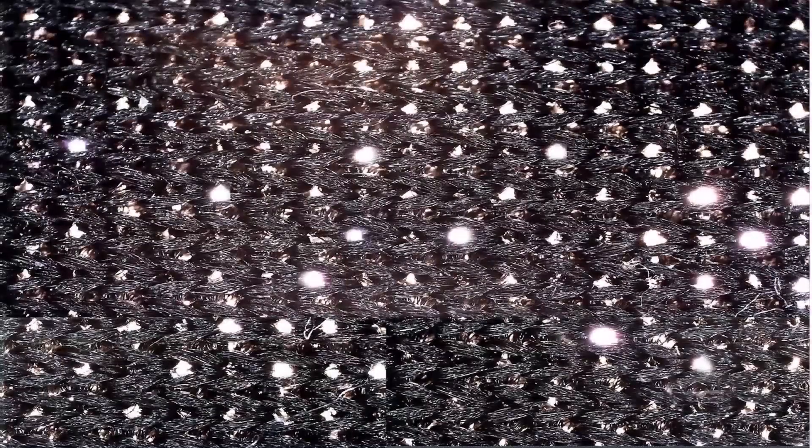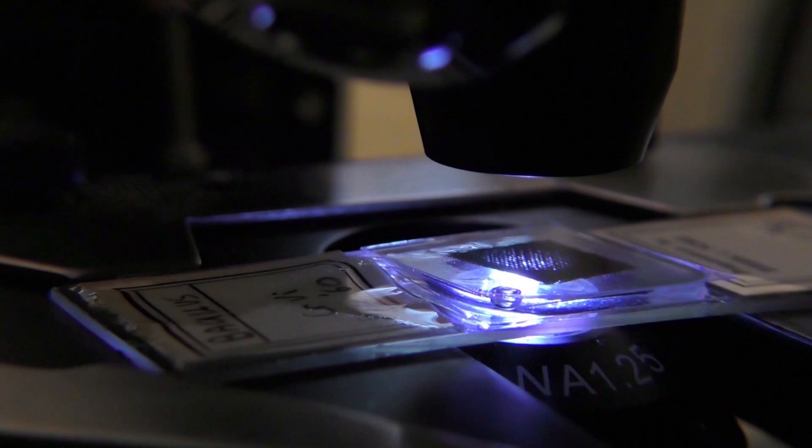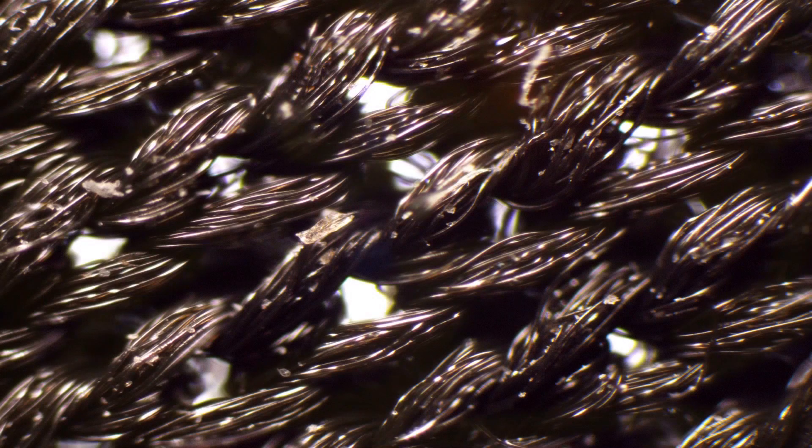It looks like crude sacking. Next we'll crank the magnification up to a couple of hundred so you can clearly see the polyester fibers from which this mask is made.